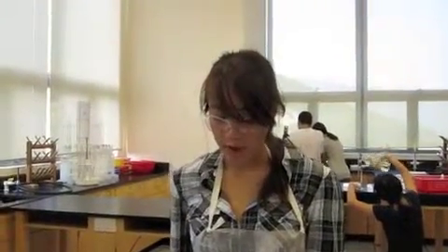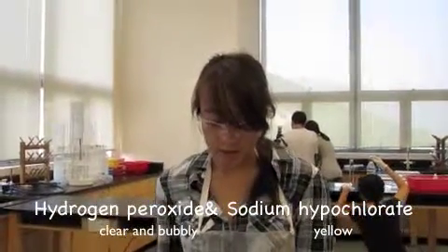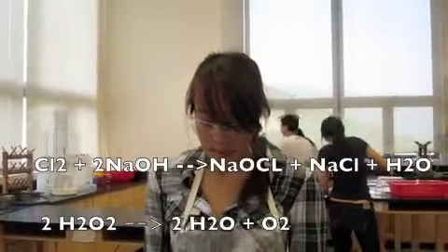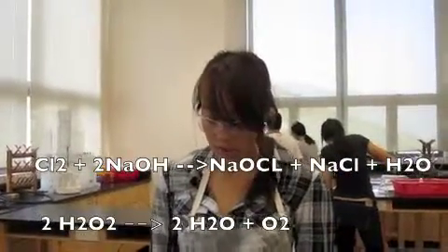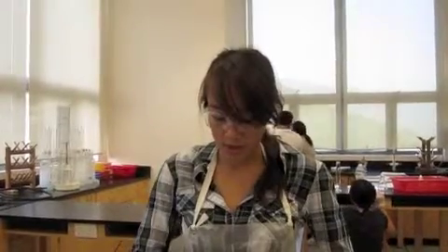On the topic of bleach and its effect on the environment, our lab group has decided to focus on two different bleaches, hydrogen peroxide and sodium hypochlorite, to determine which is more harmful to the environment by testing the rate and level at which each bleach decomposes or affects a flower, in this case a red rose. This will show us how bleach may be either harmful or ineffective when it comes to the environment.